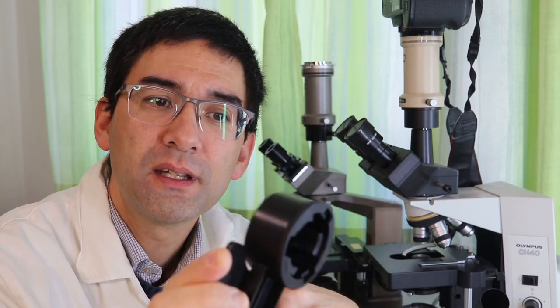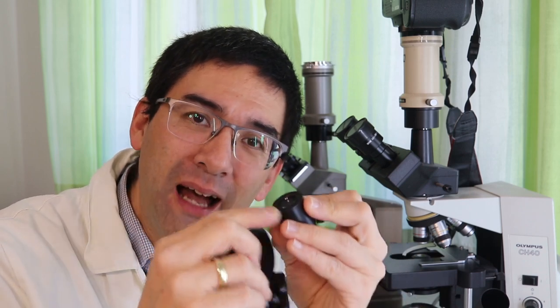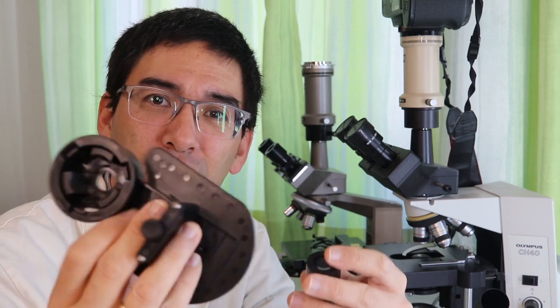However, it does not work well with the supplied eyepiece. This is the problem. The eye relief of this eyepiece is way too small. This is a problem generally of low-cost eyepieces. And this means I cannot use the full potential of this adapter because I cannot move close enough. The plastic is too solid, it's too thick, and the distance between the front lens of the camera and the eyepiece is still a few millimeters too large.